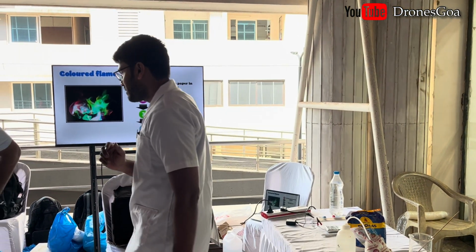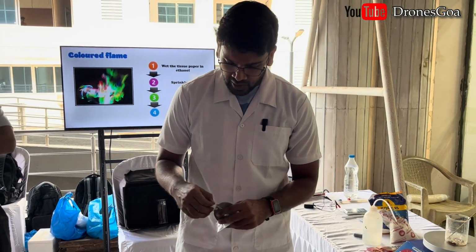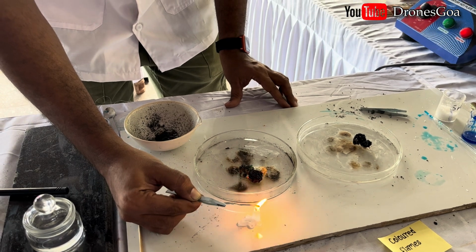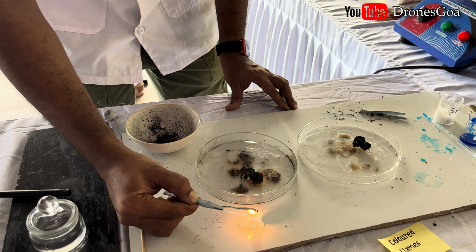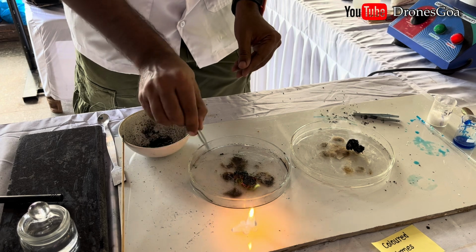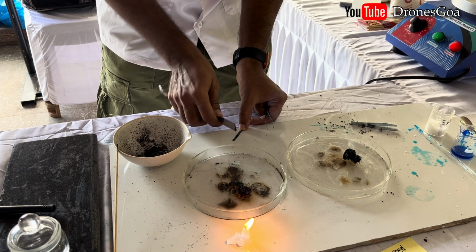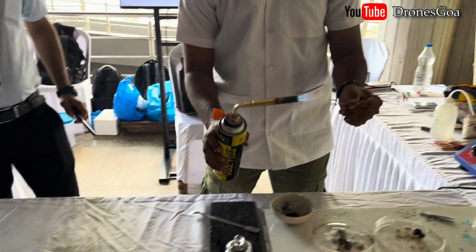I have another experiment just to show you. This is a magnesium ribbon. Usually metal doesn't catch fire, but let me light this and show you. It takes a little time because it requires a little higher temperature to burn. Maybe I'll try to polish it some. Maybe because there's a deposition of coke, it is not getting burned. We'll try with the high flame.